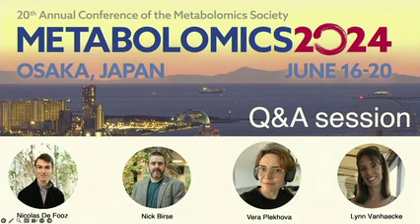We do see that the type of matrix will influence the magnitude of the mass shifts that you see, because the purer matrices, such as urine, let's say, will perform better over time, over long batches, than samples such as meats or blood plasma, unpretreated blood plasma. So it's a combination, I think all of them. I do believe space charge happens, but you might hear other opinions.